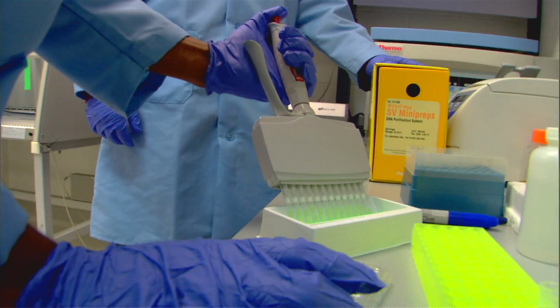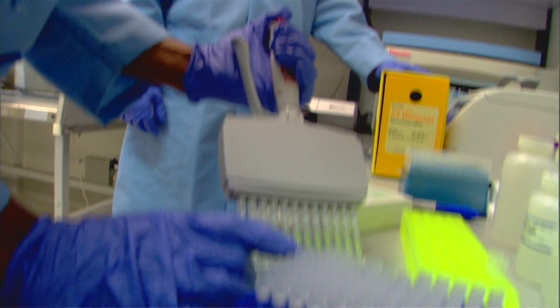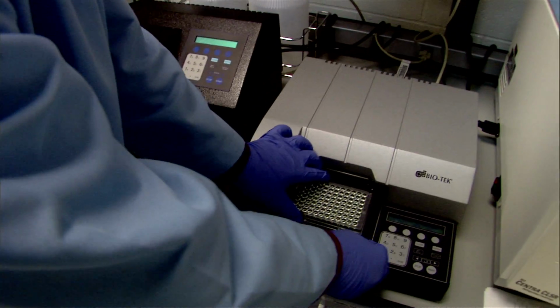We use artificial microorganisms. And what we use are fluorescently labeled powders and microscopic beads and things like that that represent the microorganisms. And in many cases act like the microorganisms in every respect except they don't grow. To be able to have hands-on live action training where it's okay to make mistakes until you get it right is what this kind of advanced training is all about. It's absolutely required in the world of select agent research, BSL 3 level research, and animal research. So the facility here is perfect for what we're trying to do.